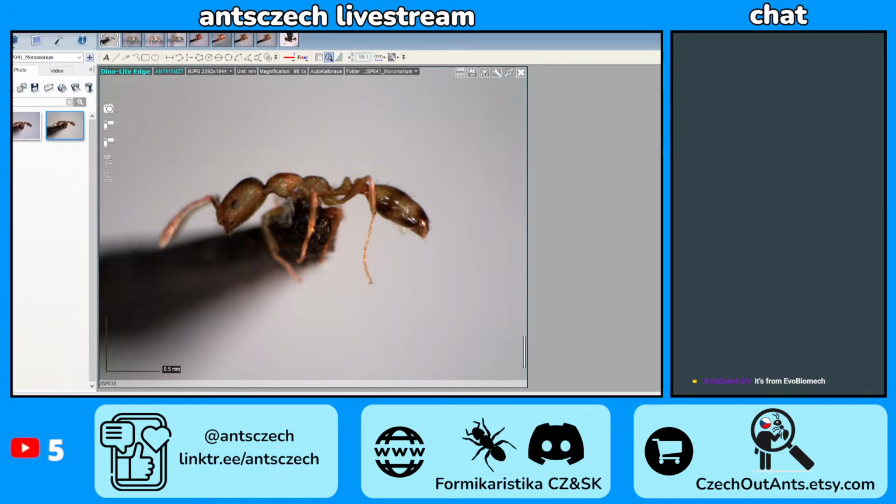It is so in the way, like it's in a position where it's even hard to move the leg away. Do you know what the white stuff is around it? That looks like glue, no? Yeah, I think it's glue, but I'm unsure. It could be some kind of debris as well.